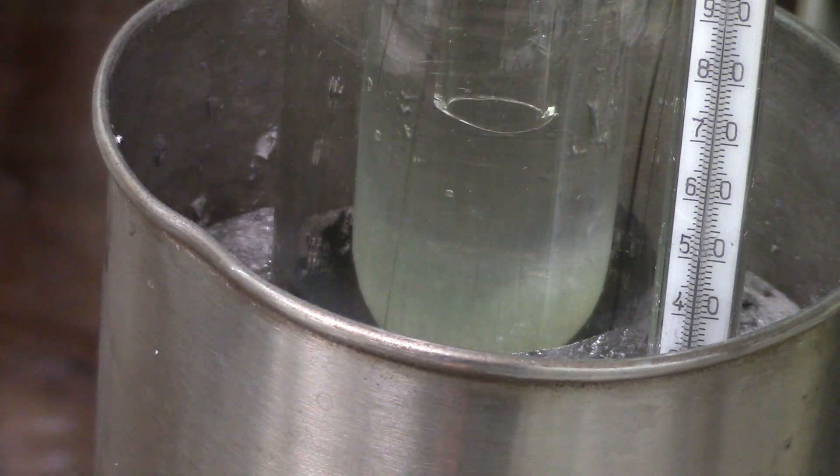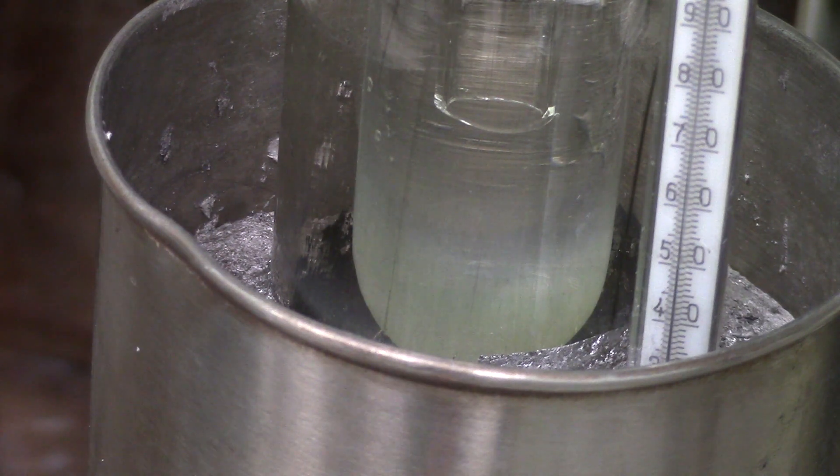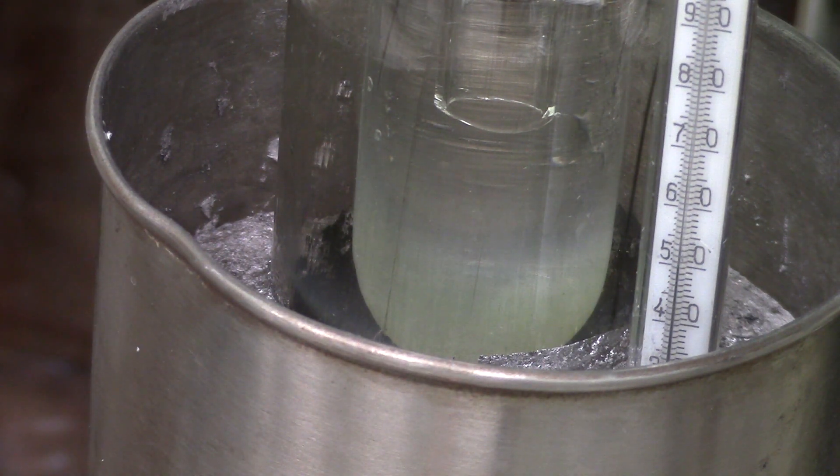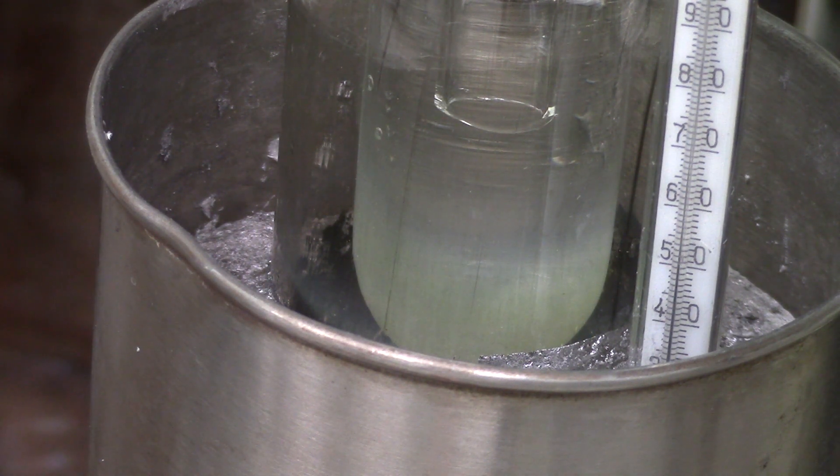How does fractional sublimation work? Simply, compound is heating to its sublimation point and turned into gaseous phase. Vacuum helps you to decrease this temperature. Then vapor just cools down on the sock.